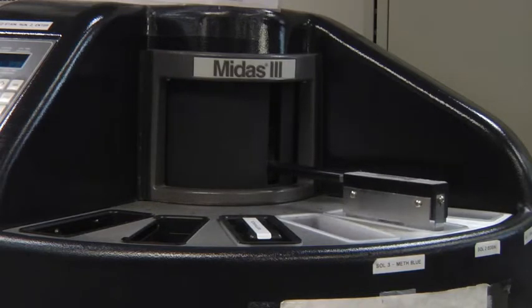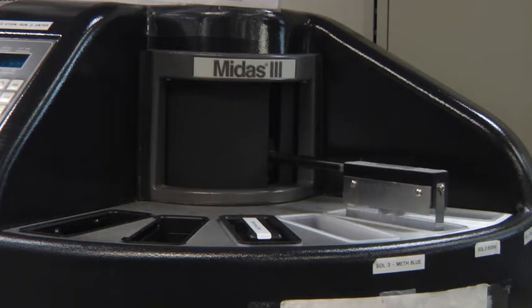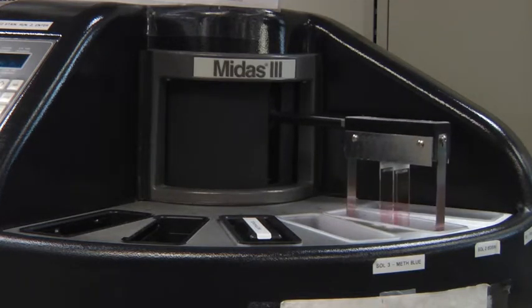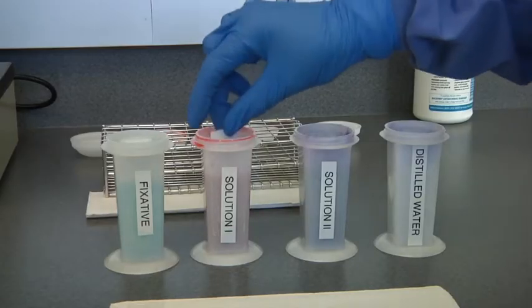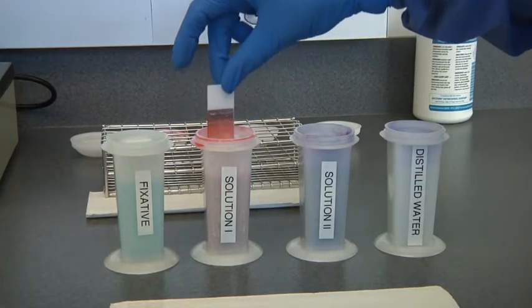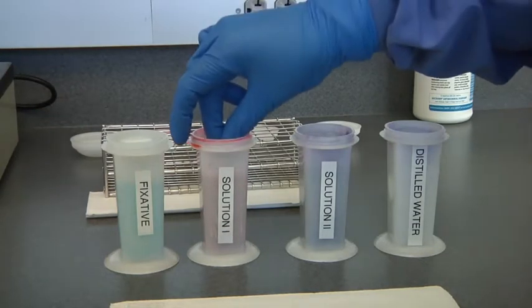After learning to make a thin blood smear, the smear must be stained in order to see the cells. Smears can be stained in a number of ways. Many laboratories have automated stainers. There are a variety of different types available. In the student lab, you will stain your smears using a manual method by dipping your slides in the staining solutions.